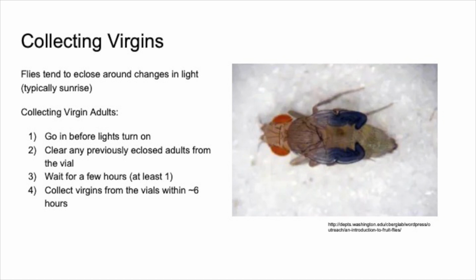So you want to wait a couple of days and check to see if there are any larvae in the vial, not eggs, larvae, because the presence of larvae shows that some of the females in there have been mated with and cannot be used in the experiment.